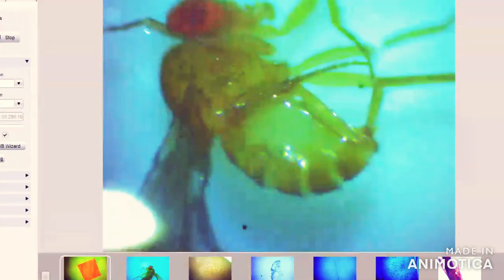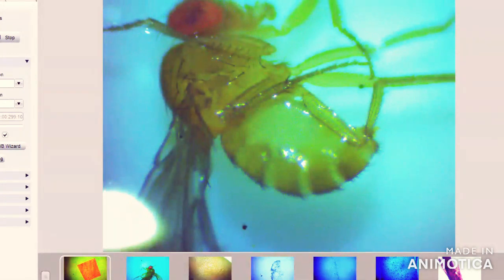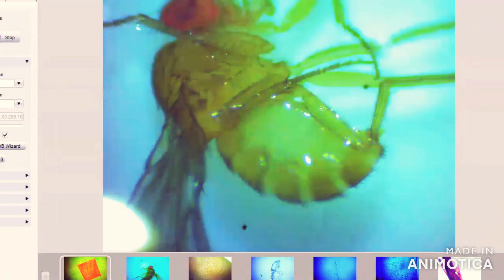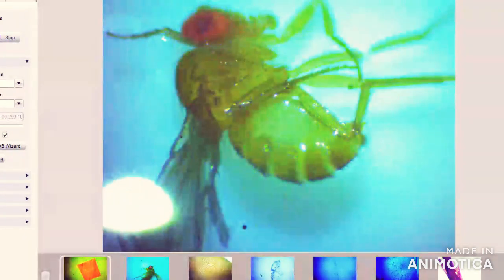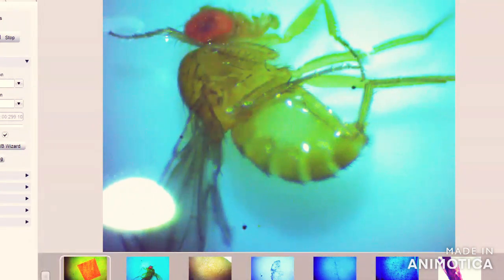The size you are getting here is approximately three millimeters in length and two millimeters in width. They belong to the order Diptera. You can see the fly is almost a little yellowish in color, and the important eye color is red, that is their ommatidia.